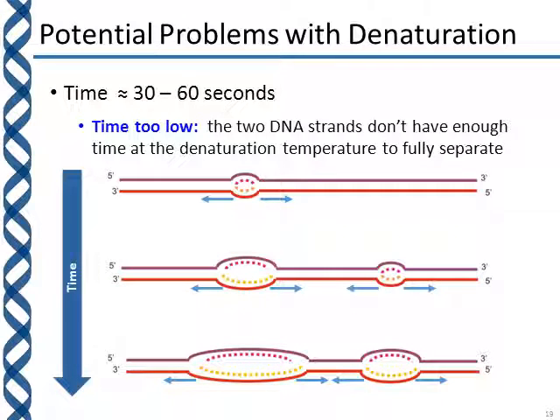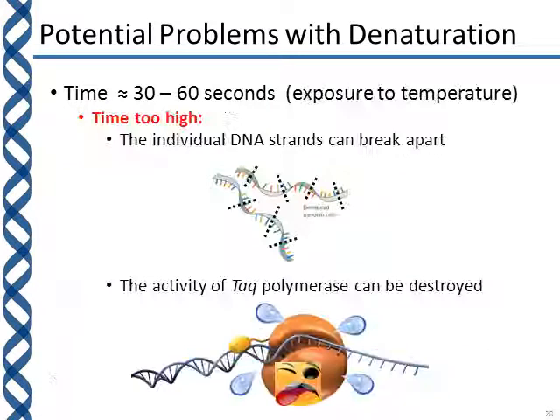But this process does take time, and so if you shortchange the denaturation step, you won't leave enough time for this to occur, and you'll end up possibly in one of these.